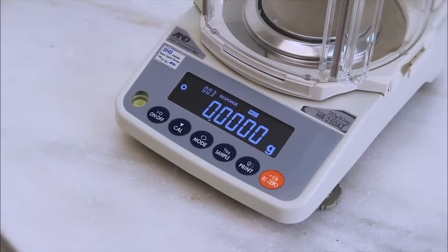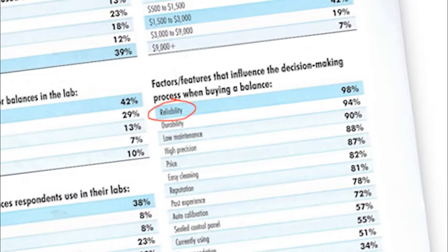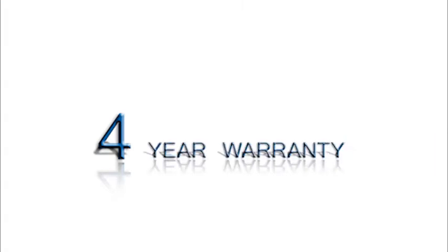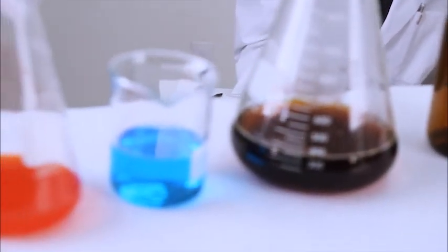The HRA Z also saves time with built-in calibration. In a recent lab manager survey, reliability was the number one consideration, cited by 98 percent of respondents. So you'll be glad to learn that A&D backs the HRA with a four-year warranty.